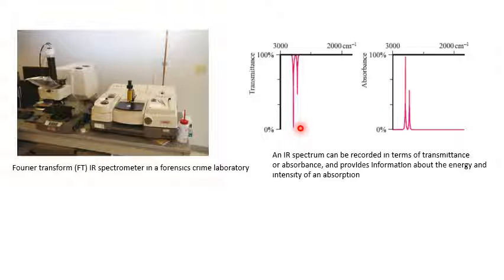So infrared spectra can be recorded using gaseous, liquid or solid samples. Spectra of gases usually exhibit rotational structure in addition to the bands arising from the vibrational modes, whereas solid samples have traditionally been prepared in the form of a mull in an organic oil, for example Nujol, or as a pressed disc in which the sample is ground with an alkali metal halide, for example a KBr pellet.